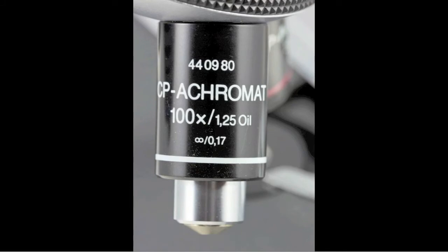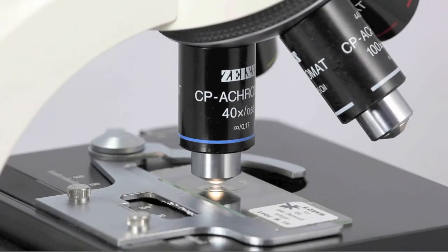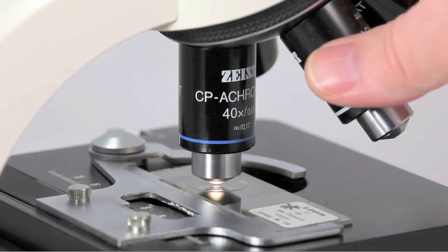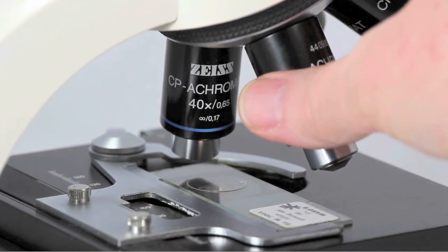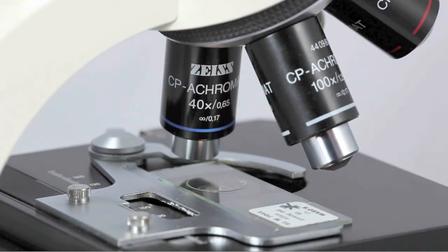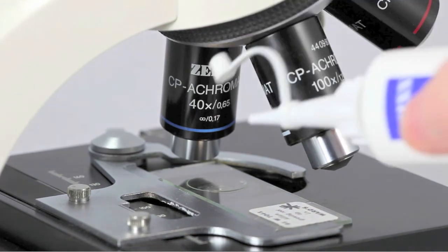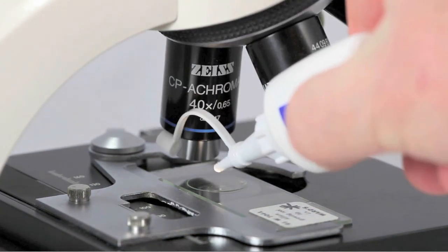The oil immersion lens requires special procedures. Once you have focused and centered with the high-power objective and adjusted the light, then rotate the high-power objective out of the way and place a drop of oil in the center of the slide.